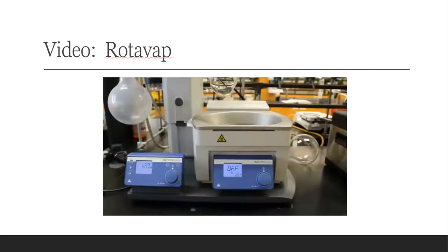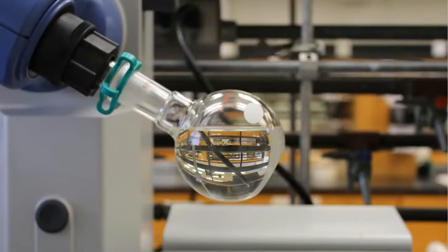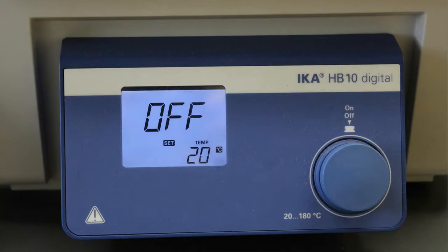Okay, folks, so there's the rotary evaporator, or rotovap. Here's a close-up picture of my Florence flask again with my ether and my peanut oil in it. We're going to figure out how much peanut oil is actually here. And in the next picture, you're going to see a couple of settings. The one that I want to focus on first is the water bath temperature, and that's going to be the big knob over on the right-hand side of our rotovap. So it's actually attached to the water bath itself.